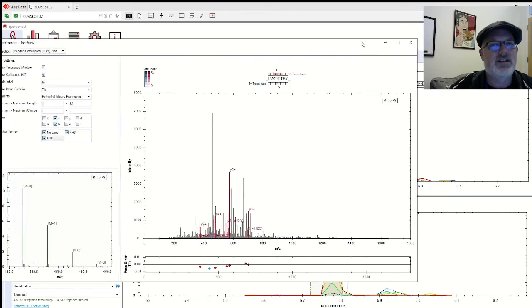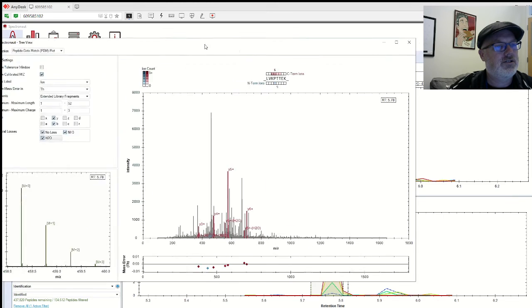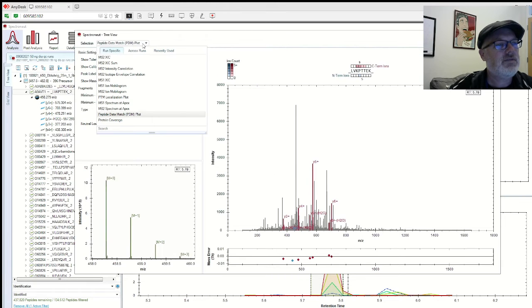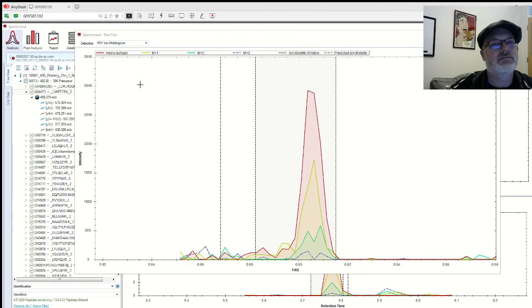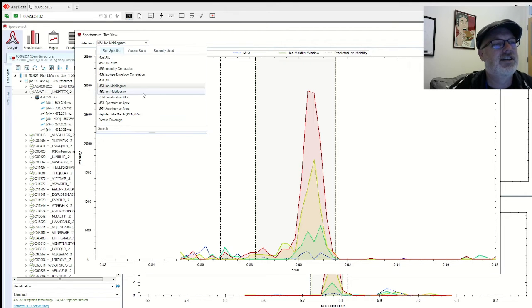It's awesome. Okay, we can also look at, let's see, what's the MS1 ion mobilogram? So this is the predicted ion mobility, that kind of fourth dimensional data. You can see it matches. So this is the prediction. This is the real ion mobility. So it predicted it to be around 0.87. It's actually about 0.90. Is that good? I don't know. I think it's good.